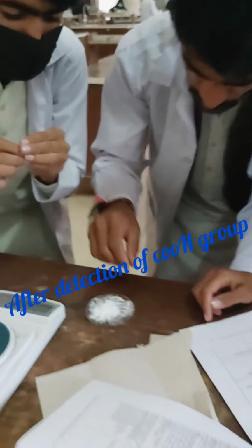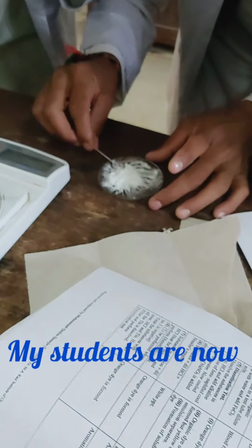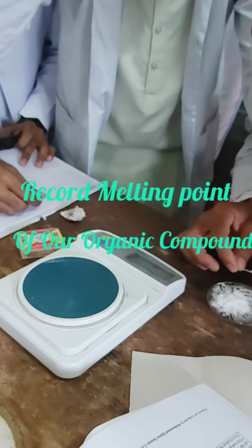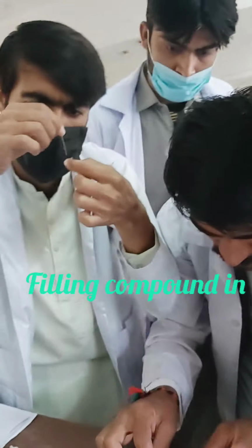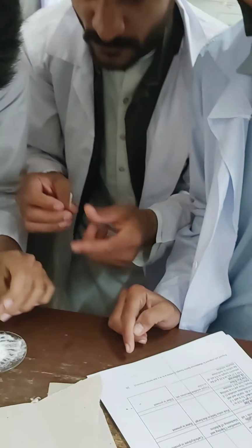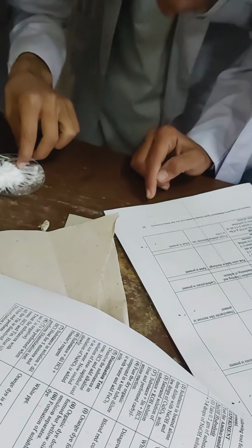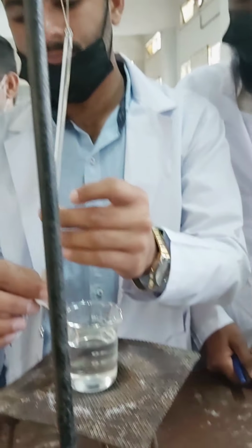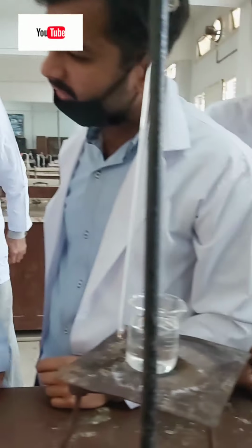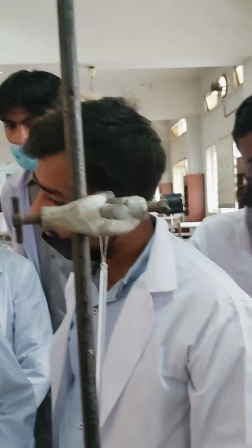My students are now filling the compound, benzoic acid, in the capillary tube. First they recorded the weight on the weighing balance, and now they are filling the compound. Did you seal your capillary tube from one end? Yes, ma'am. Great, because I forgot to tell you that you need to seal them. There are also capillary tubes available that are already sealed. The paraffin oil assembly is ready, and they are waiting to fill the capillary tube so they can adjust it with the thermometer hanging here.